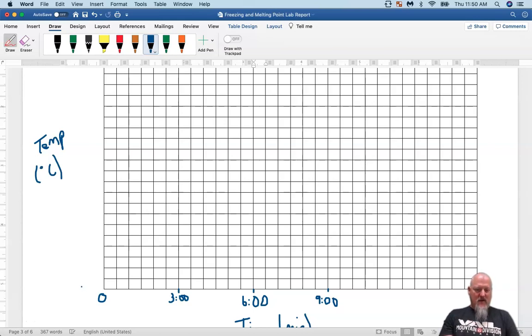Now I'm going to just start with the lower line is 40.0. So I'm going to write 40.0. And since our readings on our thermometer are to that 1 decimal place, I'm going to write it like that. So then I'll do this every 5 degrees. 40, 41, 42, 43, 44, 45. So right there is 45. And then 46, 47, 48, 49, 50. So that'd be 50.